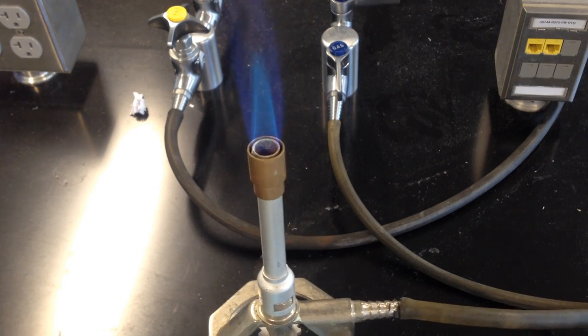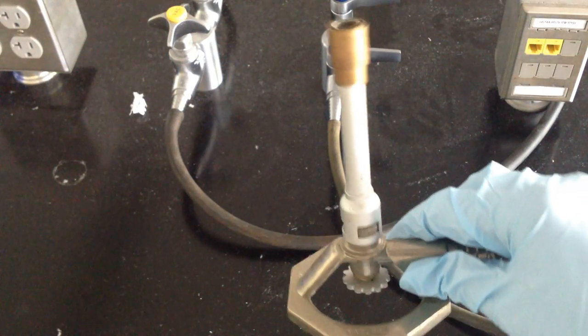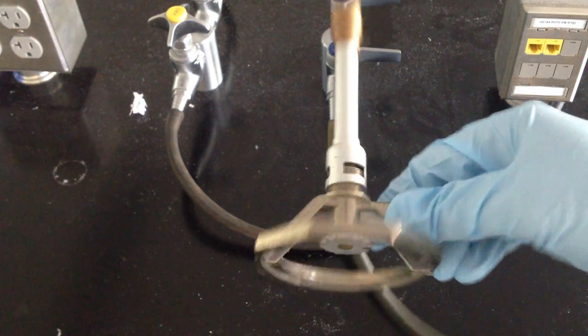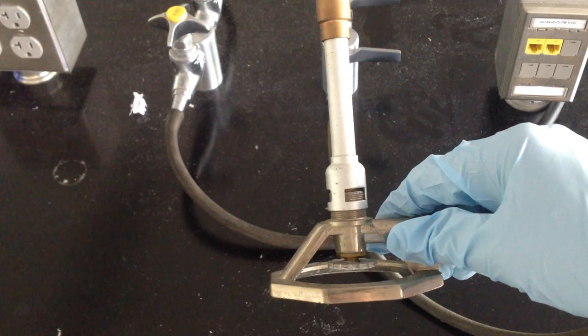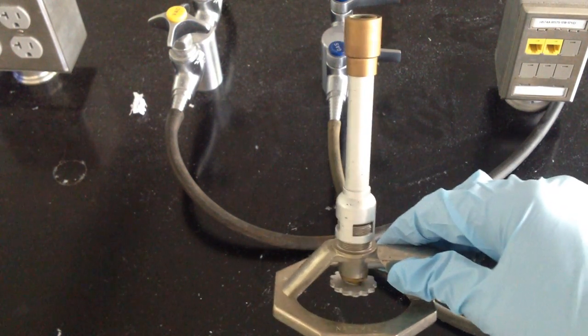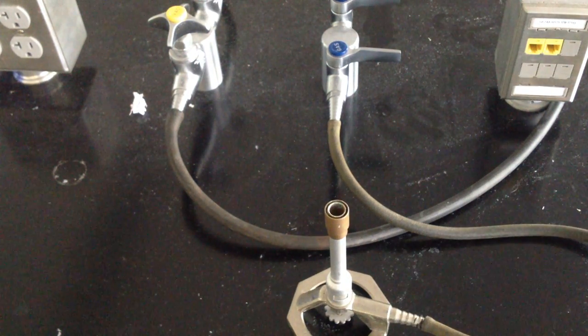To turn off the Bunsen burner, all you need to do is turn the gas off. And once you've got your valves in a place that you like, again, about a full turn on the bottom and about halfway up on the neck, then you can leave it this way and simply connect it up, turn the gas on, and light with the striker in future labs.